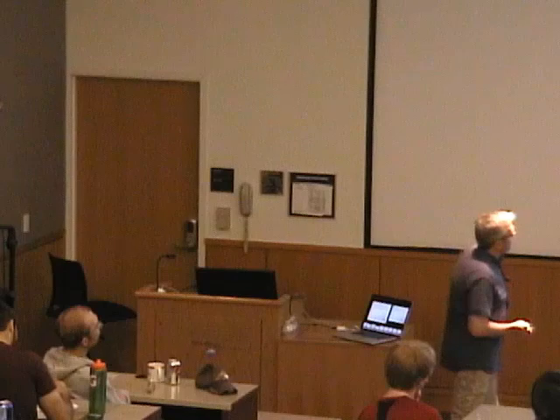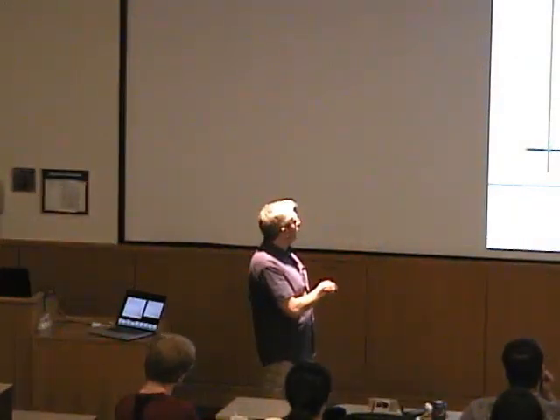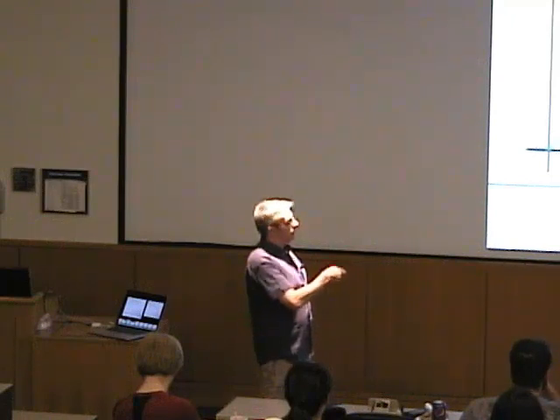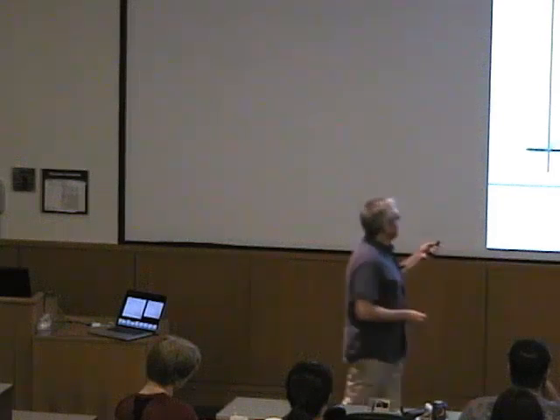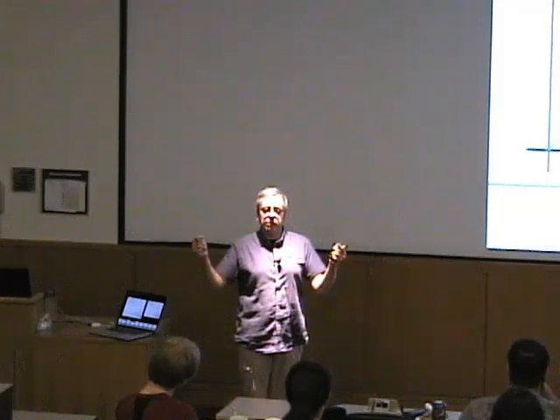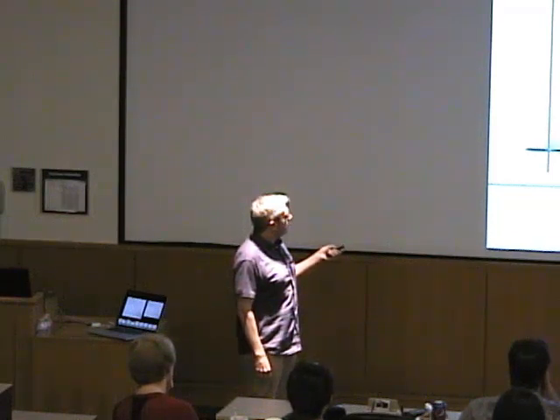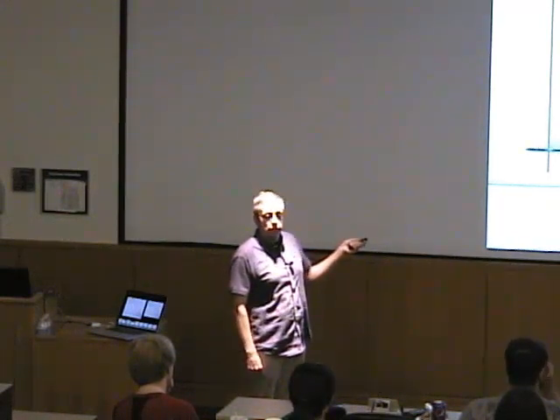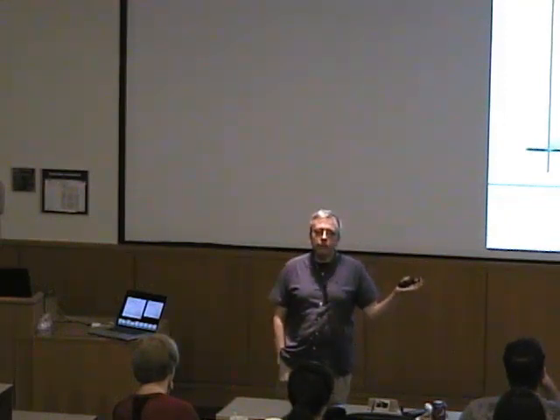So imagine an Argand diagram, and now it comes to these vectors. So you get a vector for any of your reflections. And this is a vector for your protein with, let's say, a given heavy atom. You work with a metalloprotein, your protein might have an iron atom or something. And this vector is the simple vector sum of all individual diffraction contributions of all the atoms. So you might as well take that apart into the contribution from all the non-metal atoms and all the heavy atoms here. And just write it as this kind of simple vector sum. Okay? And these heavy atoms, let's say you have 3, 4, 5 irons in there, that would be simple enough.